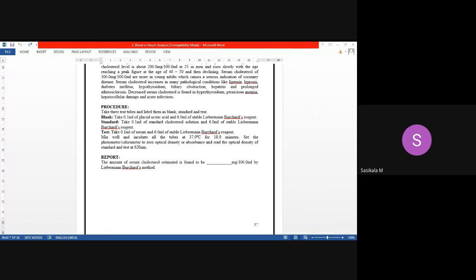Meanwhile, I'll send you the video of the Liebermann-Burchard reaction so that you will understand the concept behind it. Just wait. I will be sharing that reaction with you so that you will understand the live video. If I show it, you will understand Liebermann-Burchard's test better.